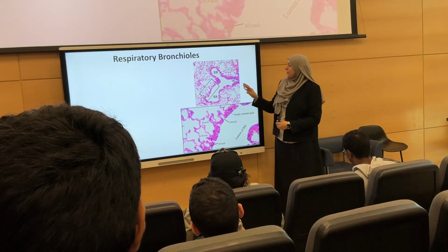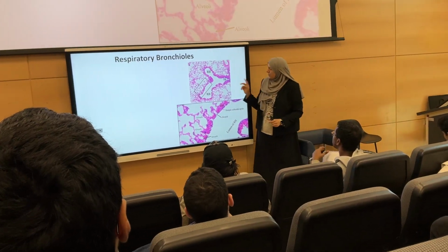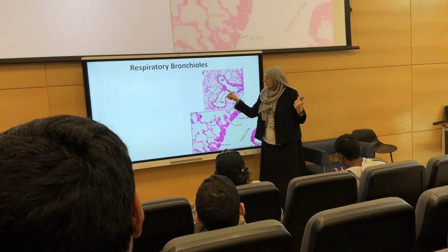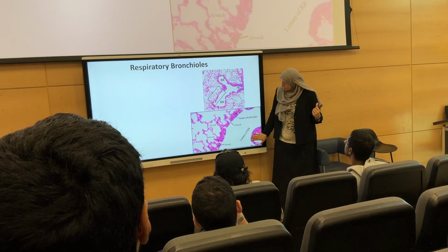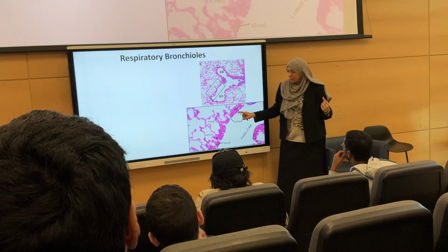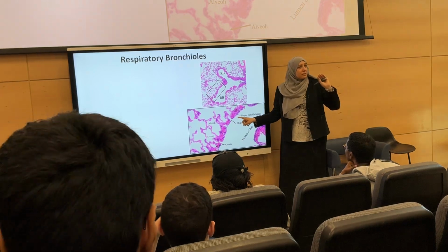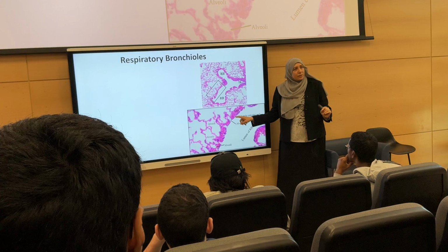So this is our slide, by the way, from the lab. What is this? I can see very simply this is a tube. Okay, we have the same layer like the last slide, which is a bronchiole, but we have protrusions from the wall, right? Then I just zoom in here. So you can find here what? The same layer like the bronchiole. What is this? We had the simple cuboidal cells. Now these cells become fewer and there are more club cells. Then what is the second layer? Smooth muscle.